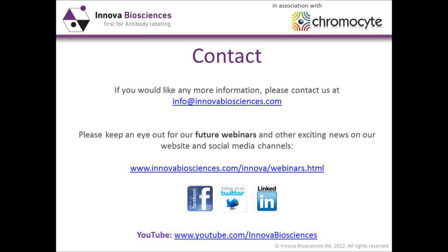Okay, and we have a question from Ashim all the way in Manitoba in Canada. He's wanting to know how to overcome autofluorescence. In actual fact, Ashim, autofluorescence is an inherent state of the cell, so it's quite difficult. In fact, cells such as dendritic cells, for example, have their own typical autofluorescence profile, and so you can actually start to look at using autofluorescence as an indicator of cell type.